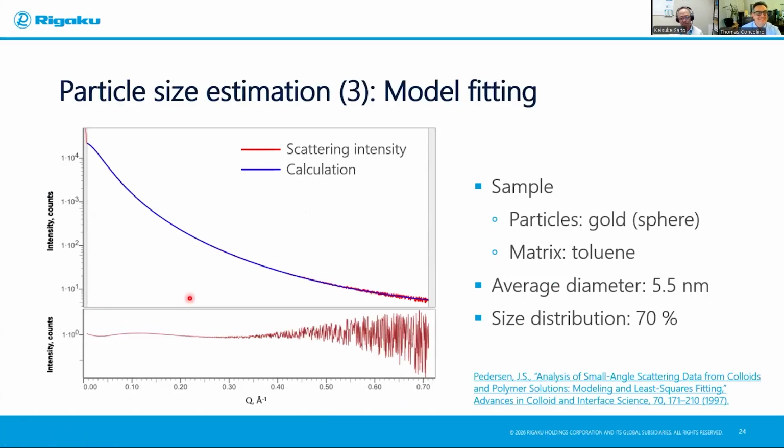For example, if you measure SAXS, before analyzing the SAXS profile we need to subtract the background. So you measure empty sample holders, then measure the same SAXS data and subtract. This kind of data reduction treatment is done by MR SAXS. Normally we don't apply smoothing a lot, but if you have to, our data manager software can do smoothing on your data. After that, you can transfer the data to the MR SAXS software to continue the analysis part.